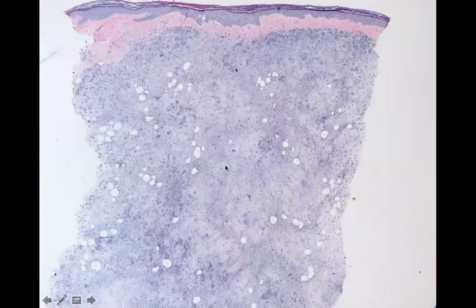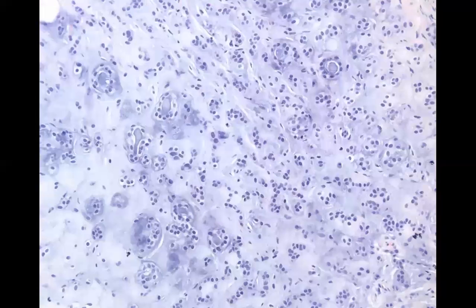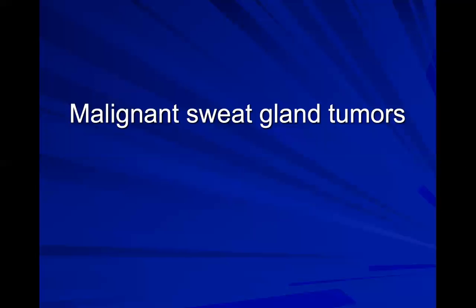This, on the other hand, is an eccrine mixed tumor. Okay, and then now look, you can see the little eccrine coils are more like circles rather than those long branching ducts. Some people refer to all of these as a chondroid syringoma. I technically don't like to use that term for both of them because syringoma really applies to eccrine things, so I would only use chondroid syringoma for this and not the other one. But if you use the term mixed tumor, then you're correct all the time, okay?